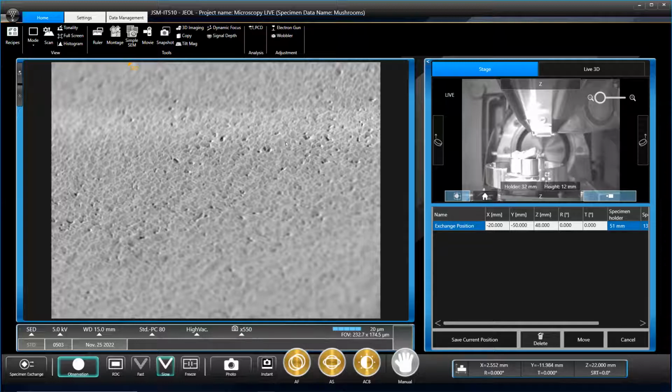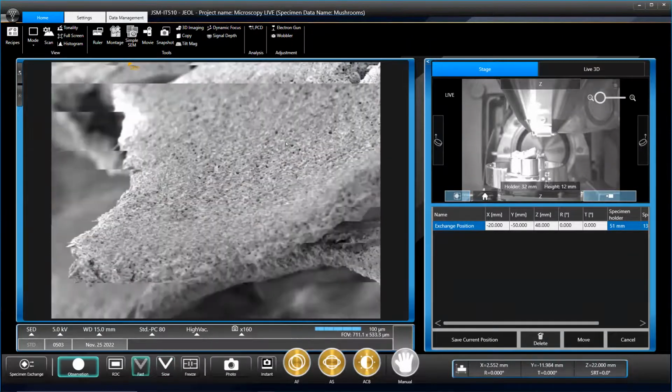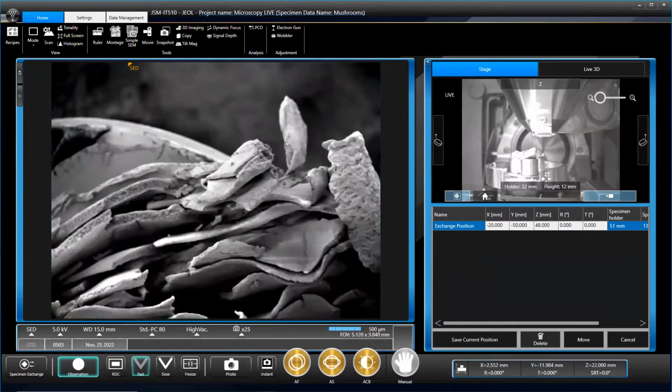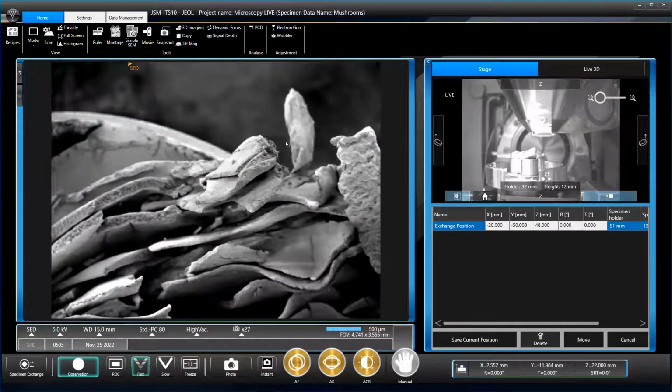The only one I did find out that I thought was quite cute is that some people call the family of oyster mushrooms oysterlings, which is much friendlier than eating nematodes and turning into a slurry. Do you want to have a drive around? I don't trust myself to focus it anymore, honestly. Okay.